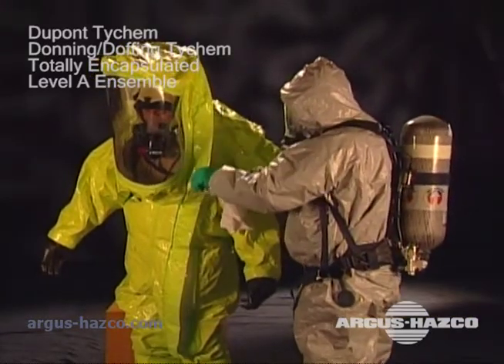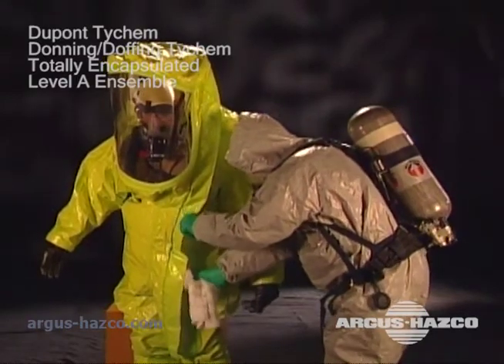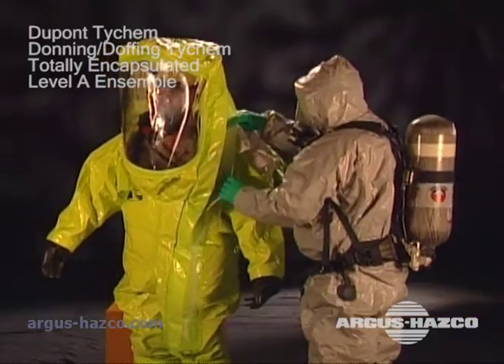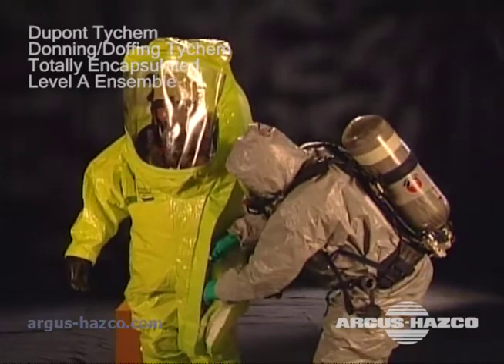The assistant starts by carefully opening the outer closure flap. He wipes the closure thoroughly to remove any liquid that may be present after decontamination. Open and wipe both sides of the closure. Next, the assistant unzips the suit.